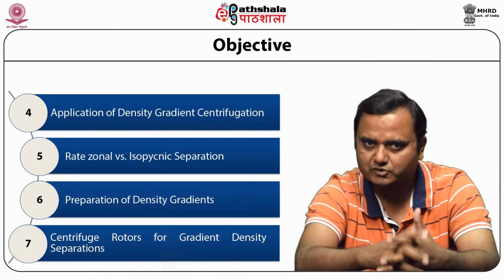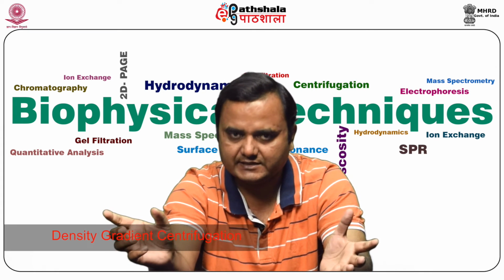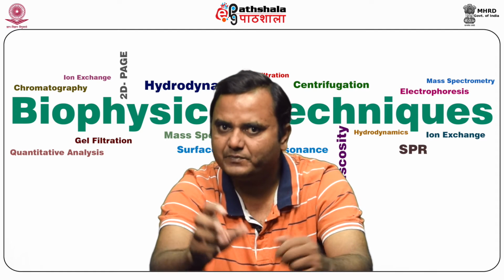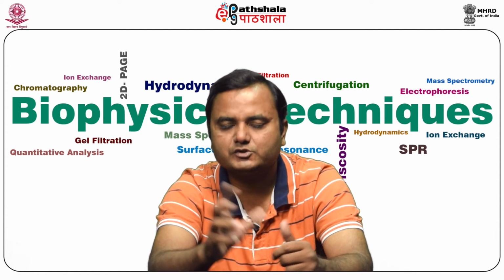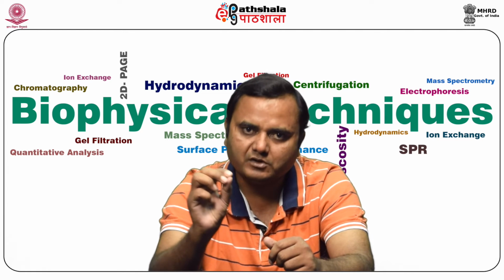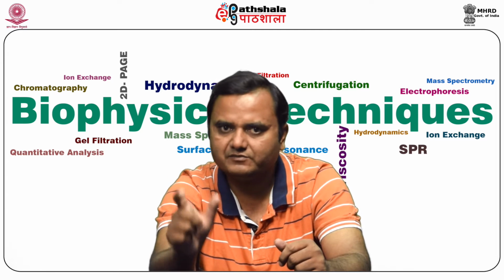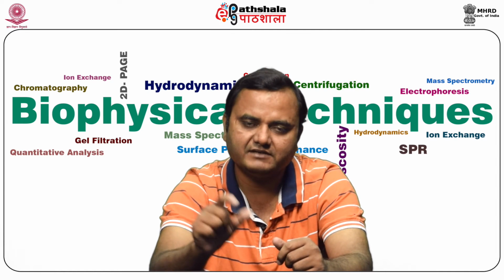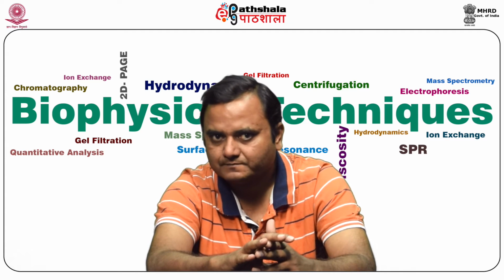So while discussing all these things, you must be familiar with rate zonal centrifugation separation and isopycnic separation. So let's discuss the principle of density gradient centrifugation, because it is based on density, and not only the density of the molecule to be separated, it should also be based on the density of the medium, because the density of the medium is a very important factor for the separation of the molecule.